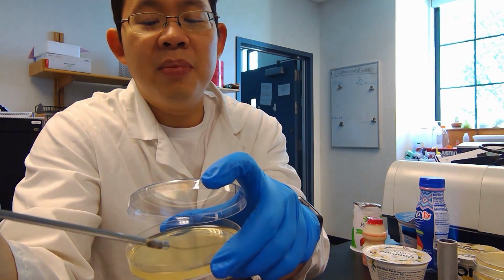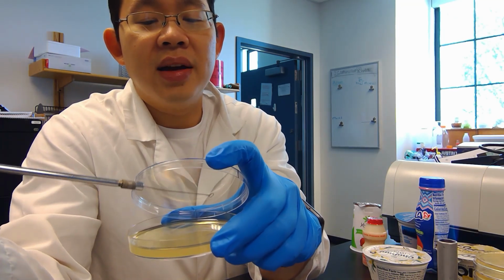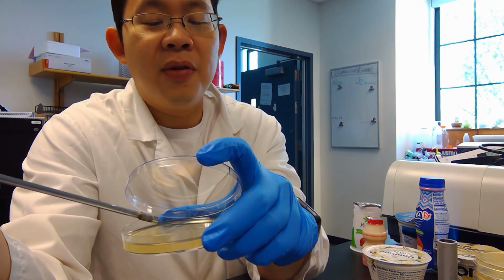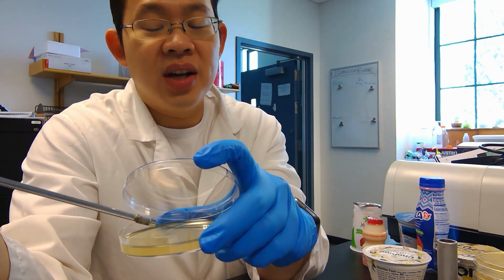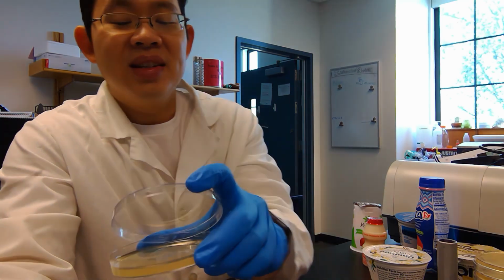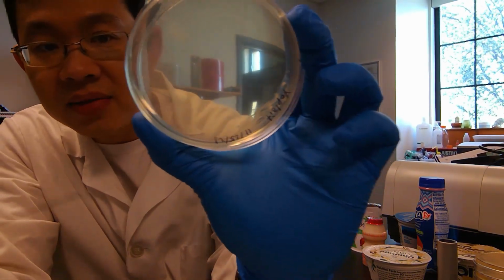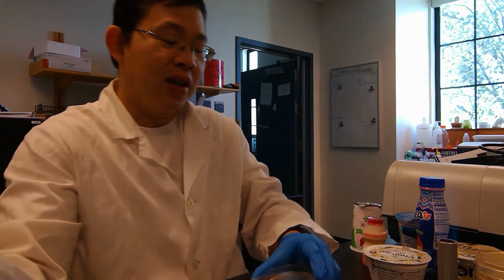Now, one thing that can be quite difficult when you perform this for the very first time is that people often gouge the agar, they basically slice the agar. You don't want to do that, okay? So now that's my first quadrant. I don't know if you can see that. Yes, right there, right? So that's the first quadrant.